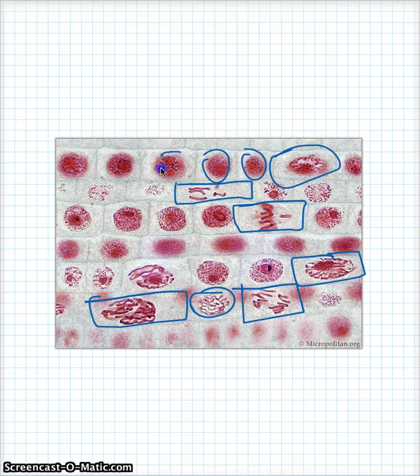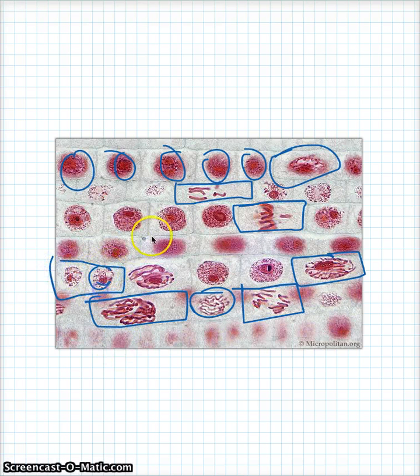There's lots of cells in interphase. Interphase, interphase, interphase, interphase, interphase. Lots of cells in interphase. Look at this guy. Probably just finished telophase. See how small they are. They're real small nuclei compared to this great big one. So we can tell it's a baby cell.